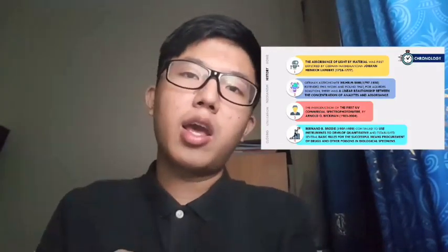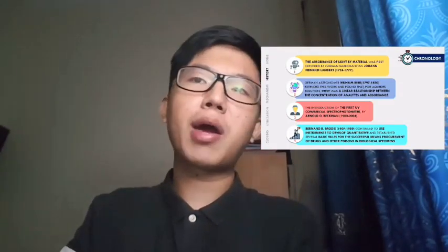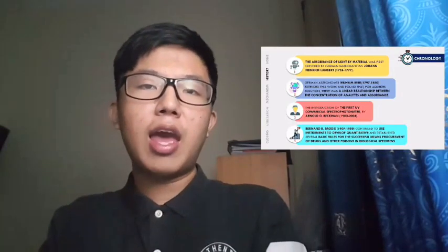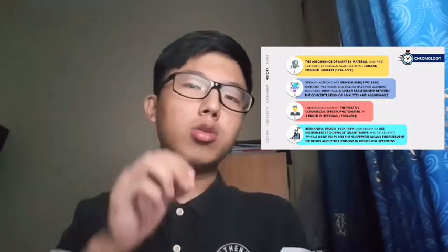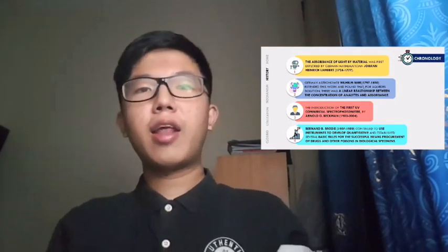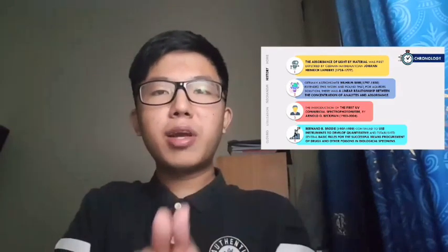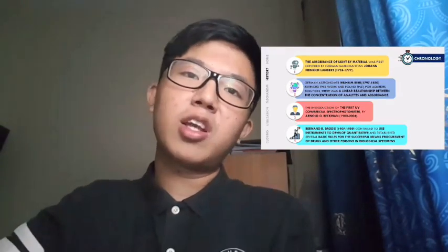The third one is the introduction of the first UV commercial spectrophotometer by Arnold O. Beckman. And the last one is a scientist named Bernard, who continued to use this instrument to develop quantitative measurement and establish several basic rules for drugs and poison biological specimens. So that's a really brief history of spectrophotometer, and we will now move on to Oleh with the mechanism.